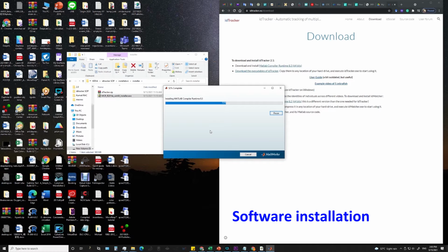Then the installation of MATLAB is done. So this one also has to be downloaded.